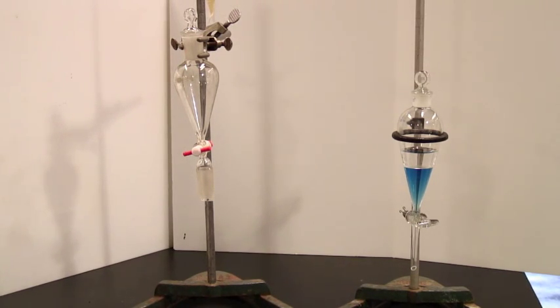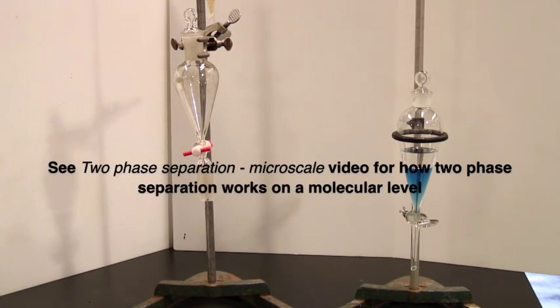The workup is a series of separation processes, and one of these can be a two-phase separation where you have two immiscible liquids and materials soluble to different extents in the two. The video on microscale separation goes into more detail about how two-phase separation works. This video talks only about the different techniques used on the macroscale.